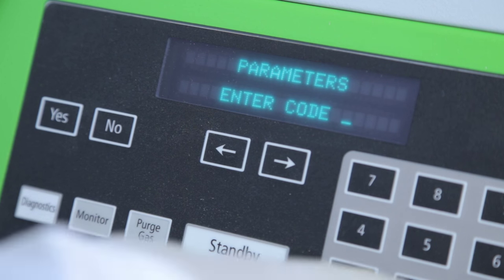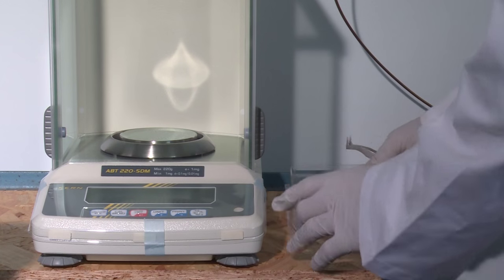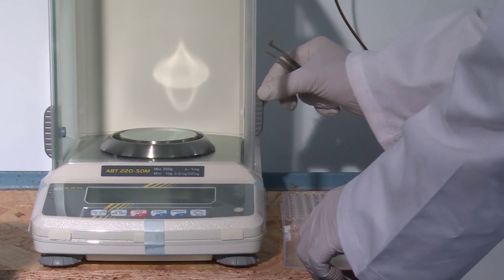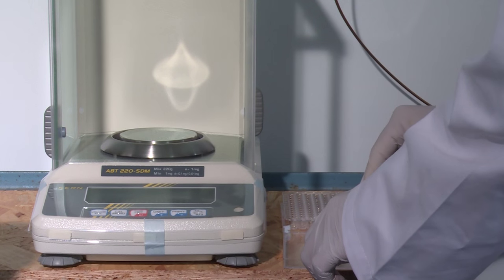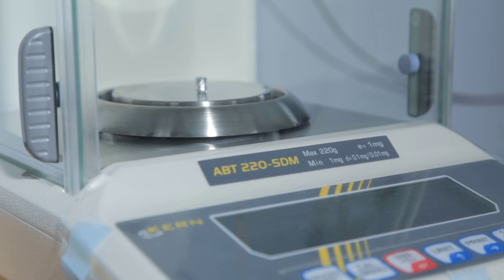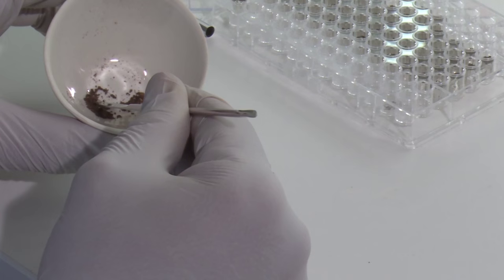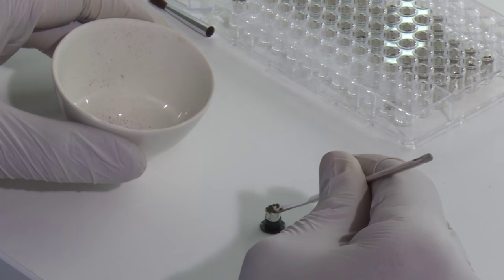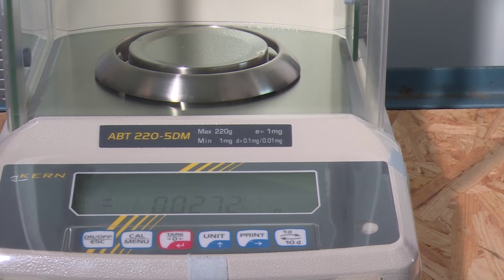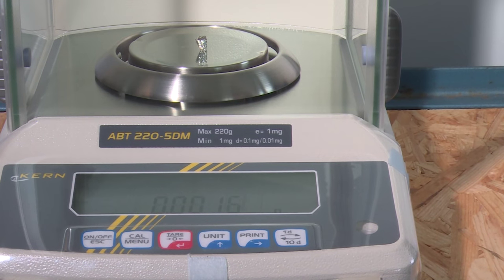Select the appropriate operation mode for the analysis, following the instructions of the manufacturer. Prepare the analysis samples by following the manufacturer's instructions and using a high accuracy balance. Using the forceps provided, place an empty vial on the balance. Close the doors of the balance and tare the weight of the vial. Carefully place 1.5 to 2.5 milligrams of a sample in the vial and weigh the sample. Note the weight once the displayed weight has stabilized.